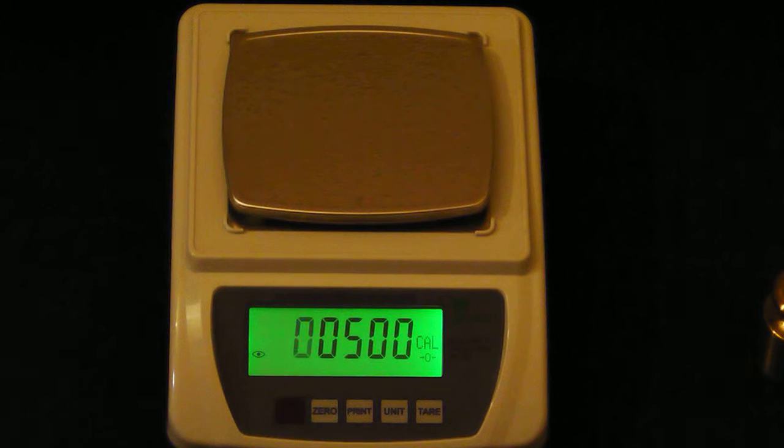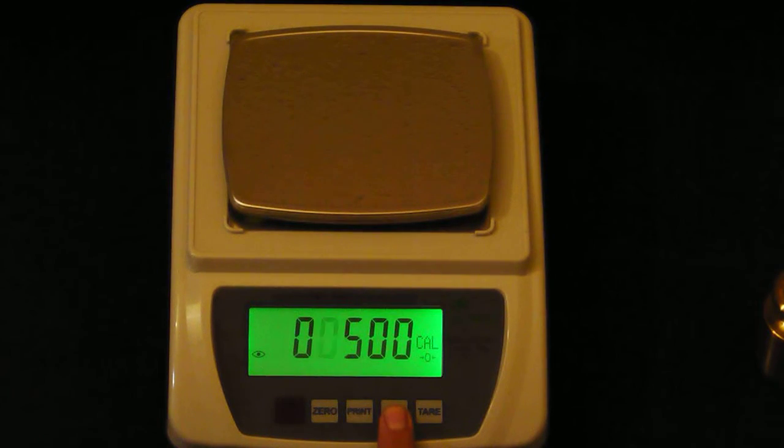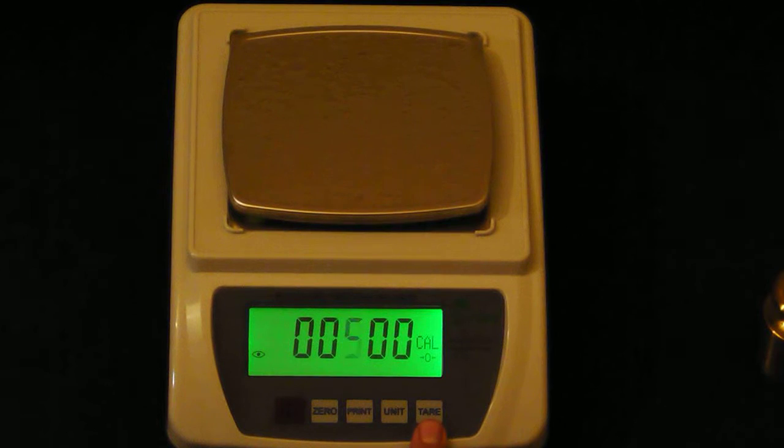Press the unit key to move the flashing digit. Press the Tare key to increase the amount.